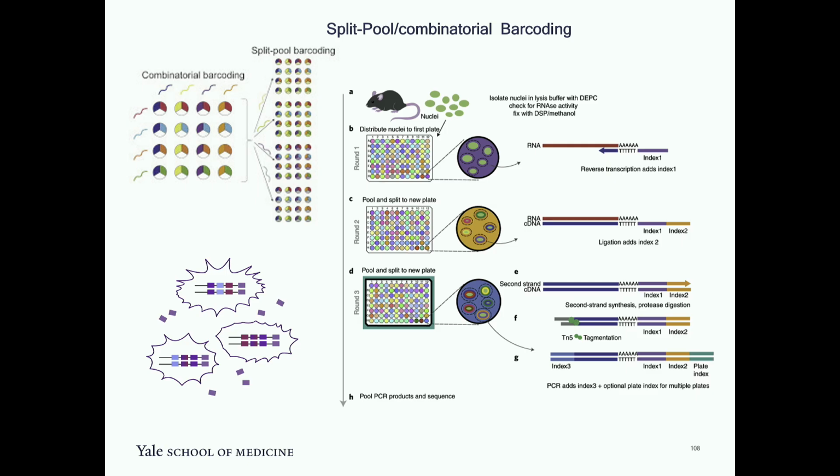Now coming back to PIP-seq. We were the lab which was providing this for them. They were providing services initially. A company called Fluent generated this system called PIP-seq, and it is again based on split pool barcoding. But now Illumina has purchased that platform. We were the ones sequencing for the last 2-3 years, and we are offering that as a service from YCGA now.